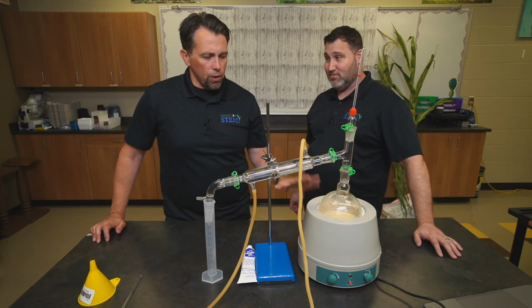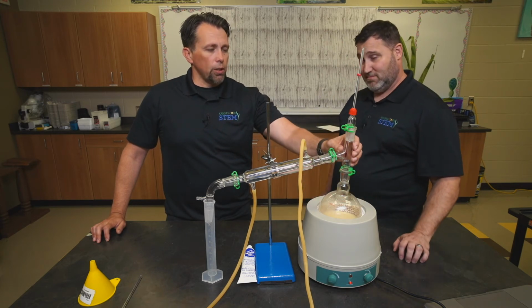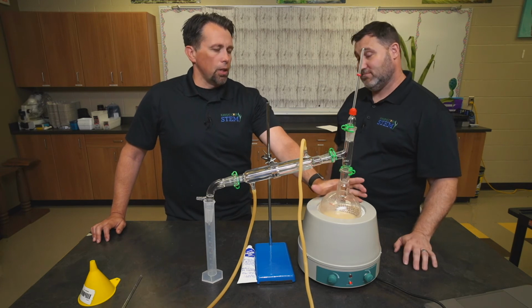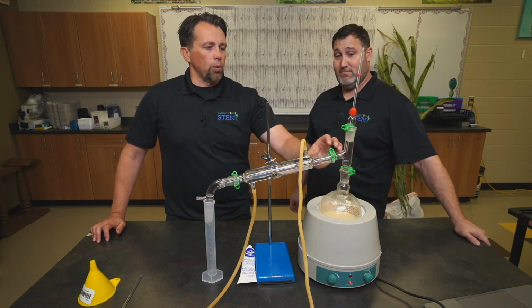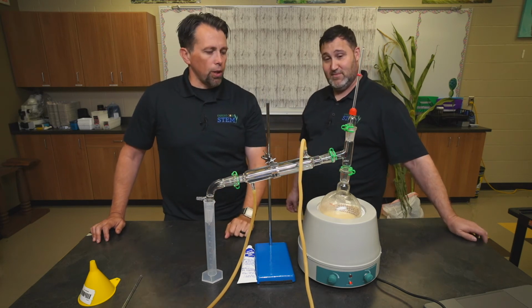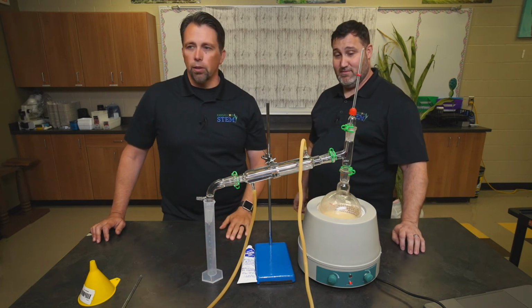Once it gets up to about 79, 80 degrees Celsius, you should start to see some condensation up in here. That's going to have some water vapor in it still, but mostly ethanol because the boiling point is lower. So that will eventually start to condense in here and drip across. We're trying to leave the water in this container and get all the ethanol into this container.